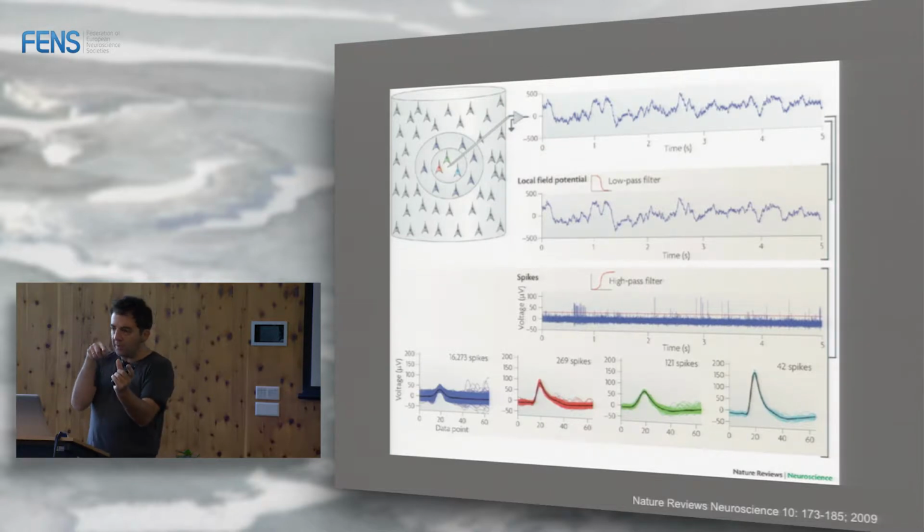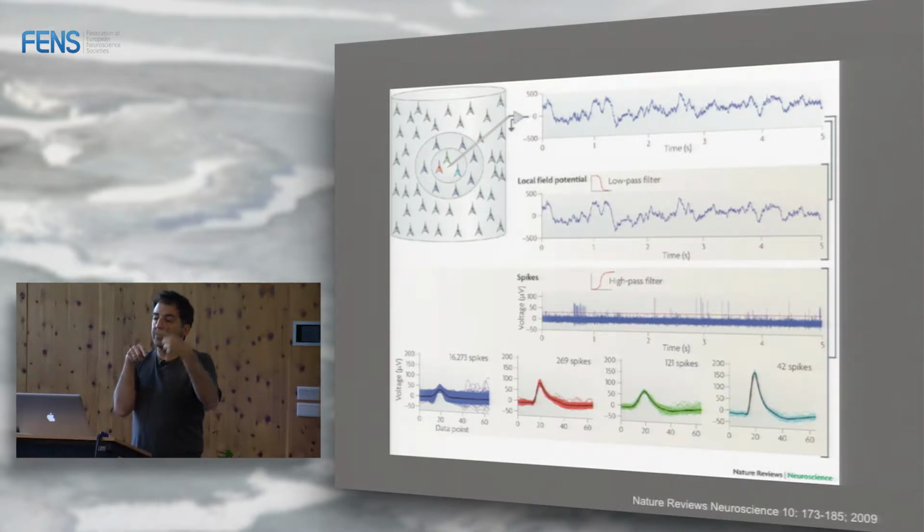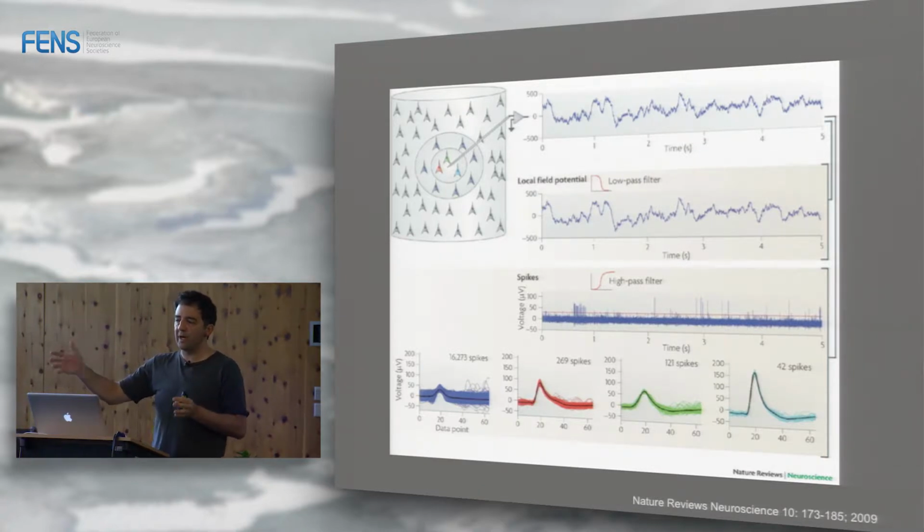And then you keep on retracting, and you are still seeing the spikes of these neurons, but you cannot split them from the other neurons. So that goes from 60 microns up to 100 microns, or so, 120. And if you keep moving backwards, then you don't see the neuron anymore.